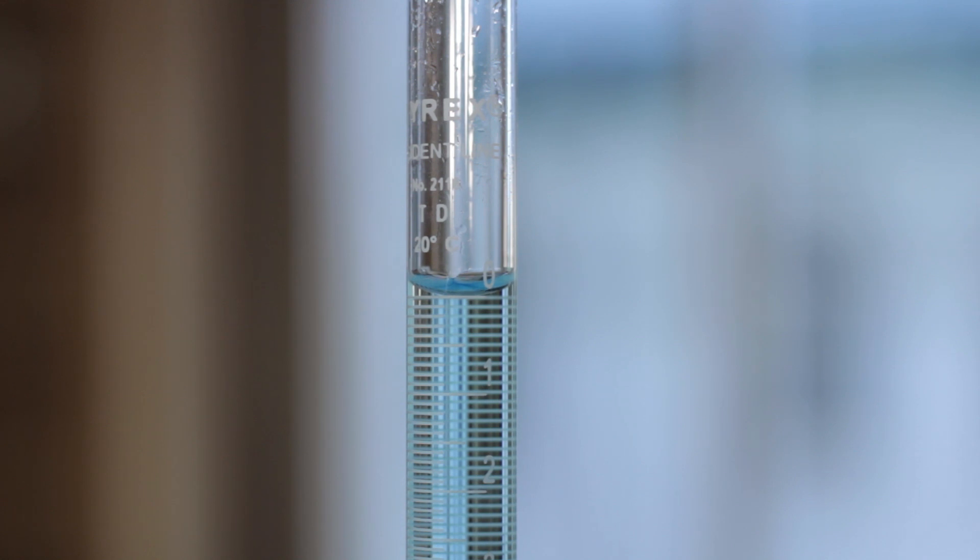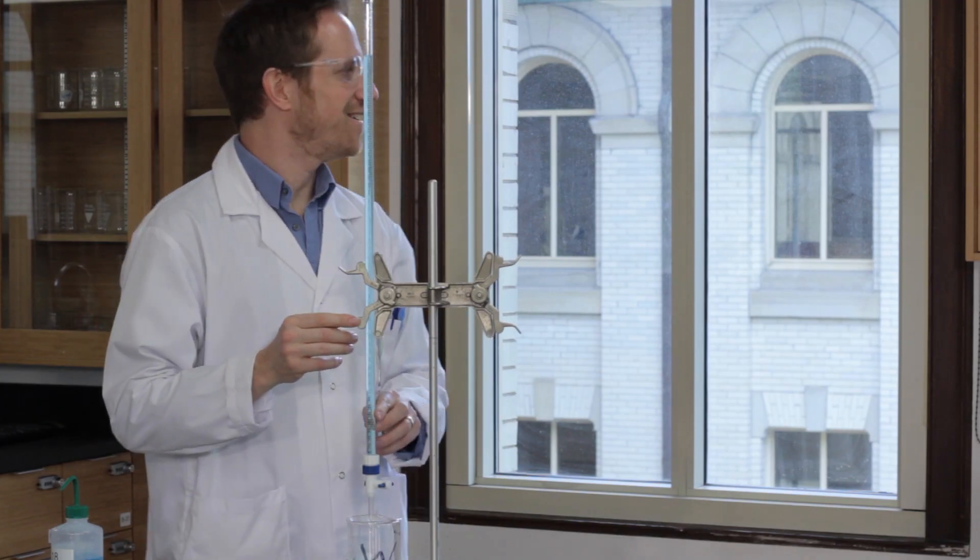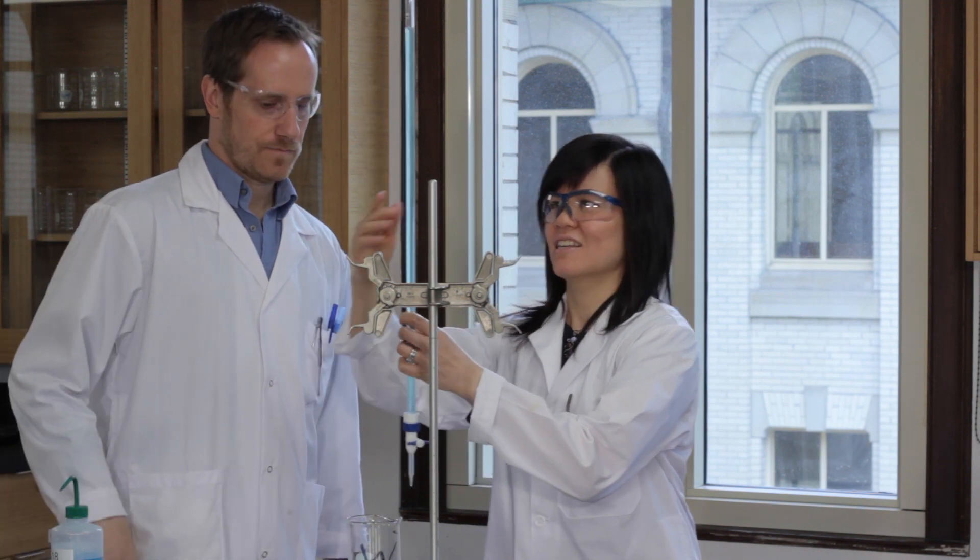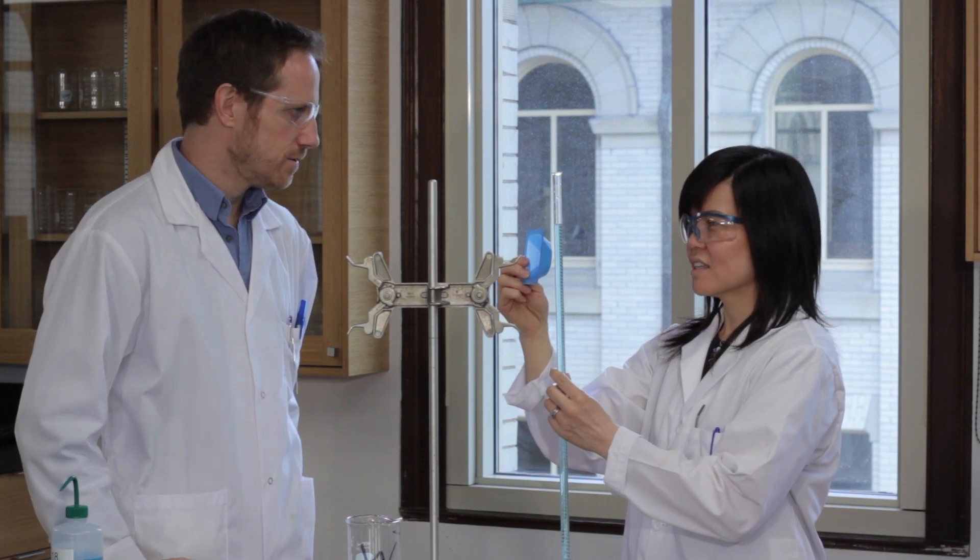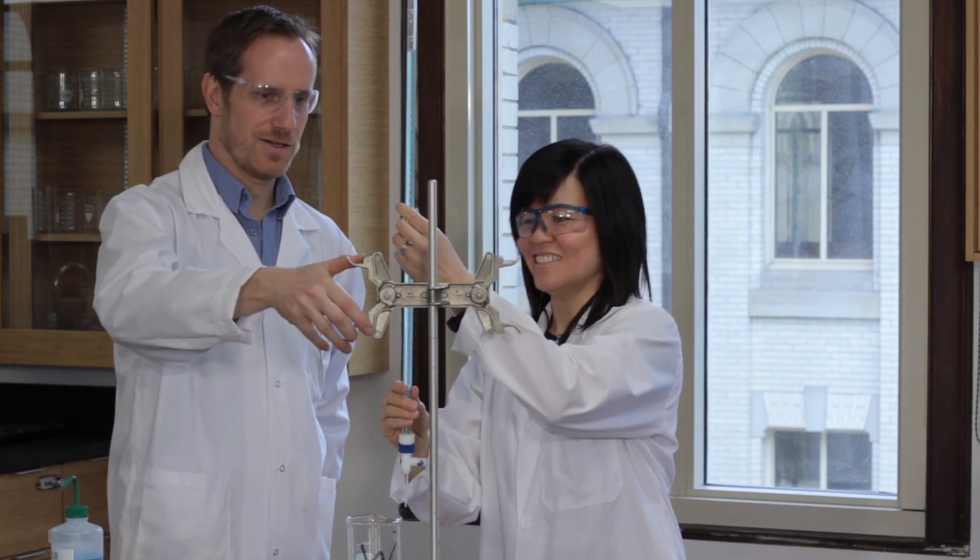Carefully read the level of the titrate in the burette to two decimal places. It's okay if the meniscus is not at the zero mark. Record the initial burette reading.